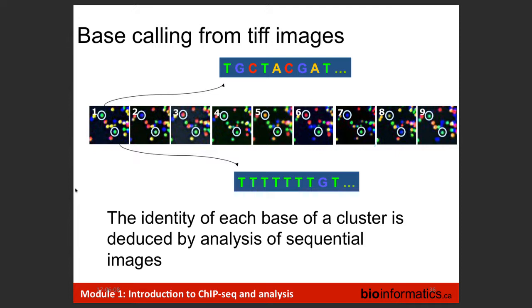I don't know if Guillaume uses NextSeq for whole genome bisulfite. There has been some suggestion that there might be some quality concerns with whole genome bisulfite data, but we haven't seen that, although we don't use it that frequently. Typically, we're doing whole genome on X platform now.